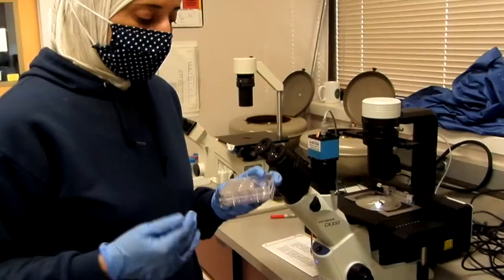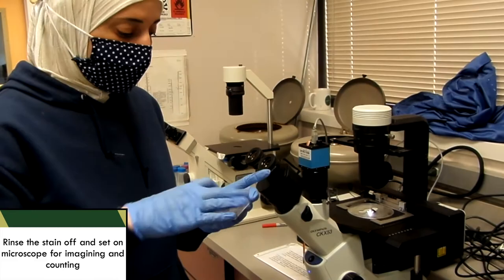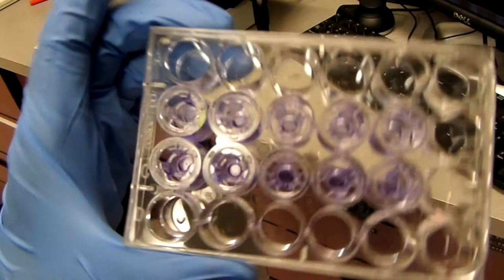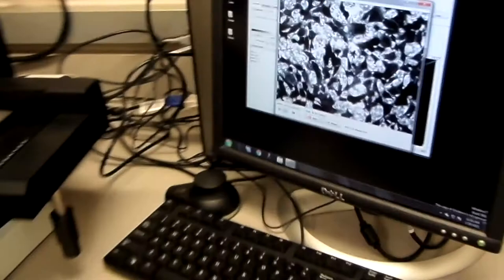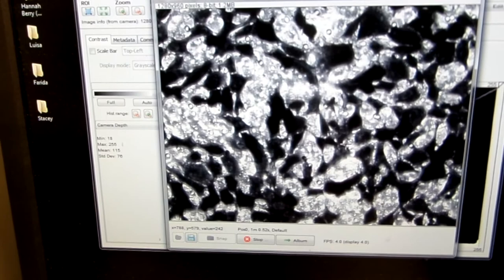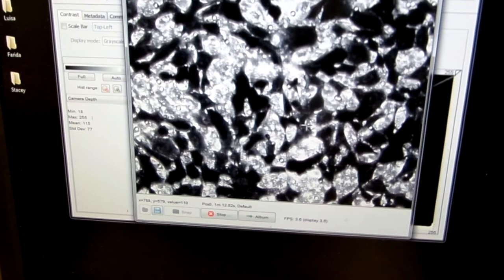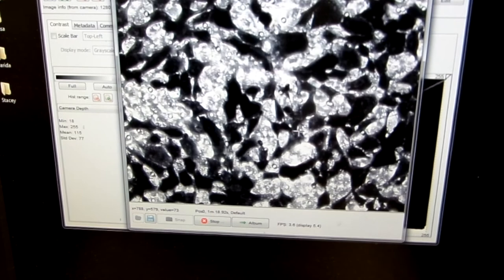After several rounds of rinsing the stain, this is how the membrane looks. And under the microscope, let's have a look. This is how the cells look like. What I'm going to do is, I'm going to take, for each treatment, 30 images or 30 fields. And then, I will count the cells in these 30 fields, take the average, and then compare the different treatments with the control. And that will give me an idea if the treatment affected migration or metastasis.